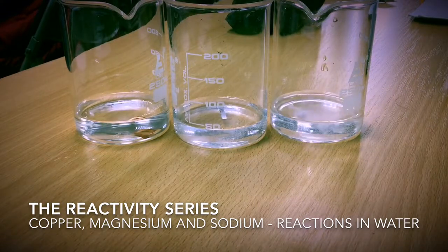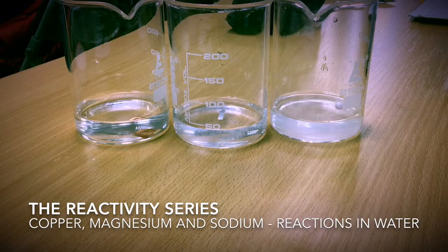Sodium clearly exhibits an immediate and vigorous reaction. The sodium forms a ball on the surface of the water and begins to move around. A gas is produced and this gas is hydrogen. We can set the hydrogen alight and we can see a bright flame produced.